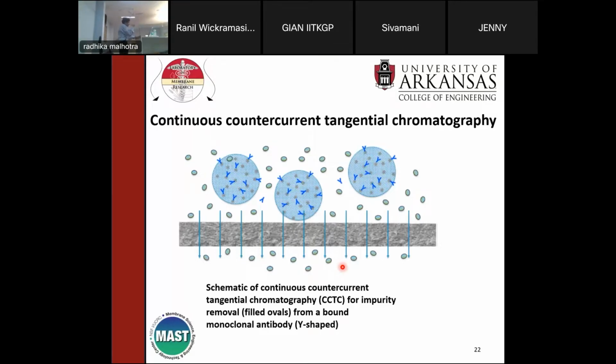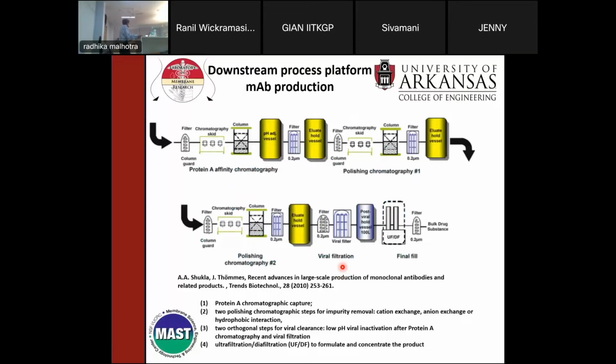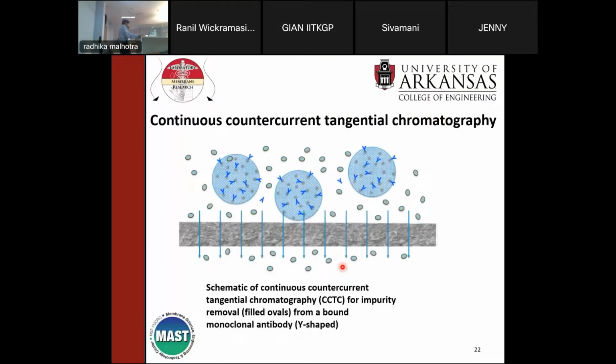So this kind of combined hollow fibers or membranes and resin particles is likely to be a direction in the future, okay? Oh, one other reason why this is an interesting way to go, all of this is FDA or regulatory authority approved, right? Resin particles are approved. Hollow fibers are approved. So you don't have such a big activation energy, if you like, to get all of this approved again, you see? So that's another reason why people are looking at these sort of combined unit operations.